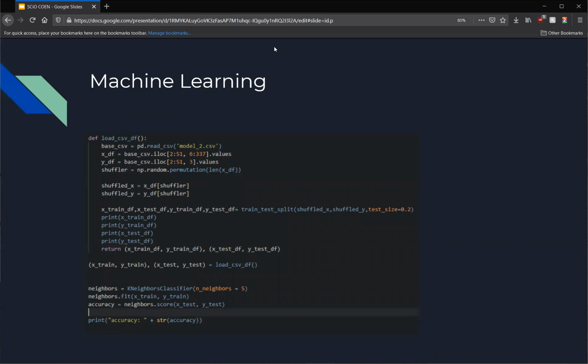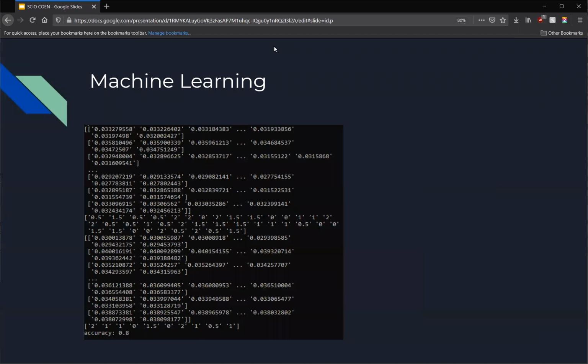We set out within Python and came up with a k-nearest neighbors classifier, and we ran our raw data sets on 3 of the main types of asphalt that we had done, and actually managed to get an accuracy of 80%. It was very exciting to come up with something much better than a random guess, which would have been 20% in this instance. We think we could do a lot more with a lot more scans, and look forward to seeing what the next students wind up doing.